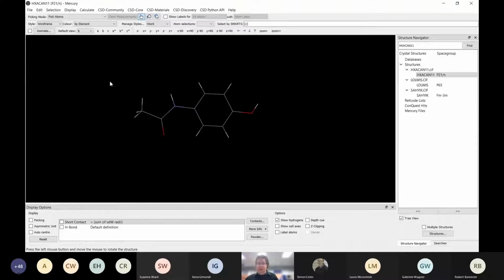That was all, as I say, mouse button clicks in space and held down. If I just left click quickly and release, nothing happens. If I right click quickly, I get a menu. We'll discuss that in a little while. If you do it on an atom, left click, you then get it highlighted. So we now have what is actually a yellow mesh. It looks like a yellow sphere at the moment, but trust me, it's a mesh. And when we do it on some other structures later, you'll see the mesh appear. And I can do it on another one. If I click again, it disappears, or I can click on a whole load of them. So that's simply how you select individual atoms, and so on. If you right click, you get a different menu, which will describe things. So that's your basic mouse controls on the screen.